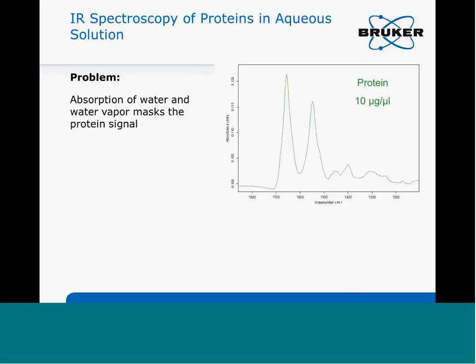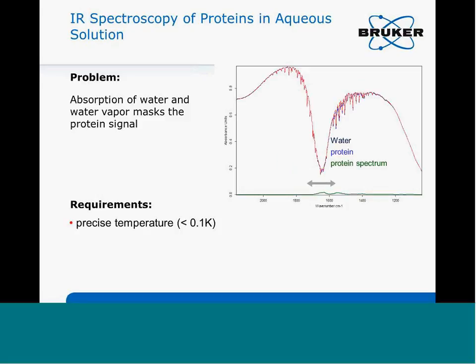And you need to be very careful. This is an example of how good spectra can be collected. In order to collect it properly, you need a big cell with a control cell, and that should be temperature controlled as well as 0.1 degrees Celsius.